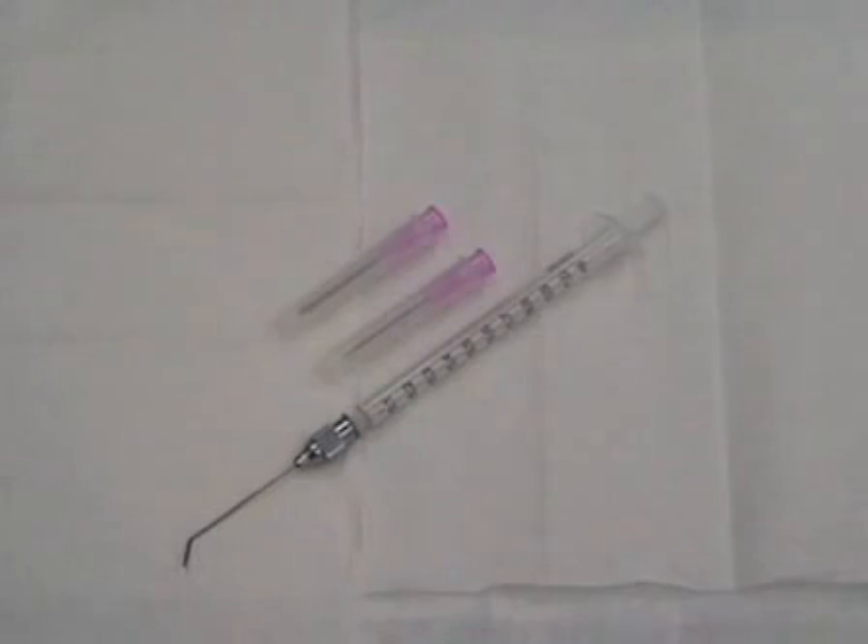Once that is achieved and confluency is found, the sperm in 9% milk solution are taken.